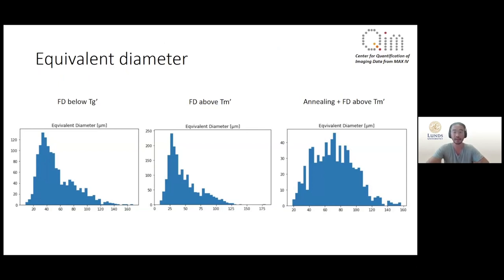By looking at these graphs we can see that the difference between the first and second sample is not that significant, while the third sample contains larger pores. It should be noticed that this is plotted to the amount. Maybe we should plot to volume then we will see a clearer difference. So the larger pore size should lead to a smaller surface area that means in turn that it's a thicker material.